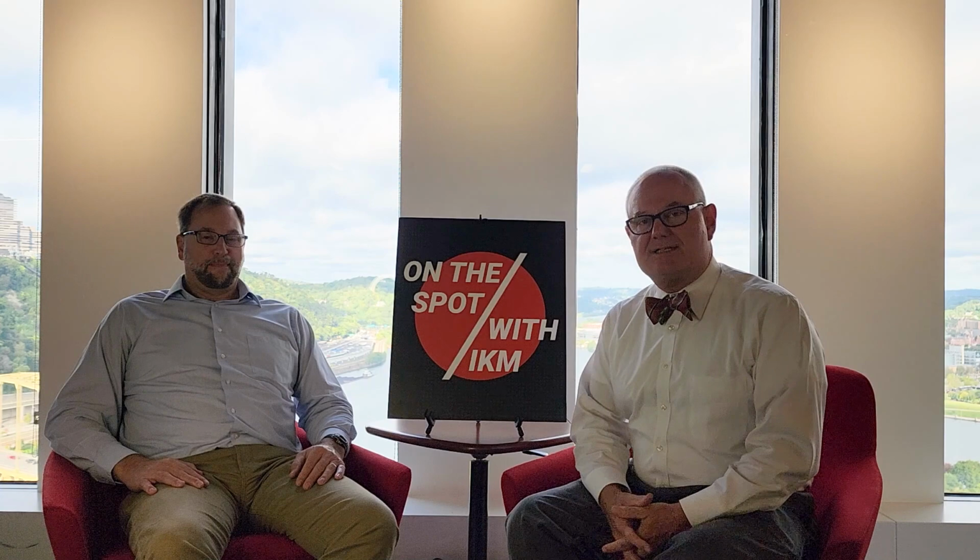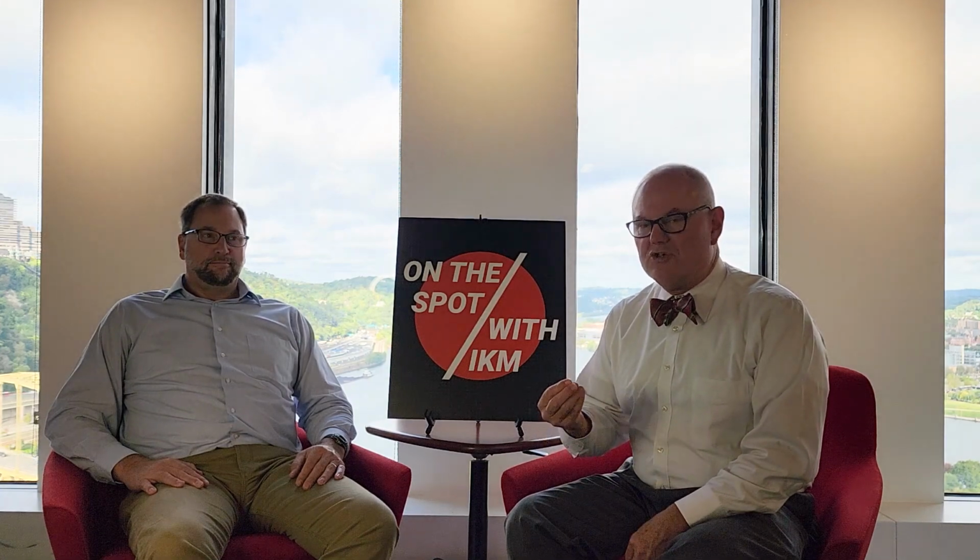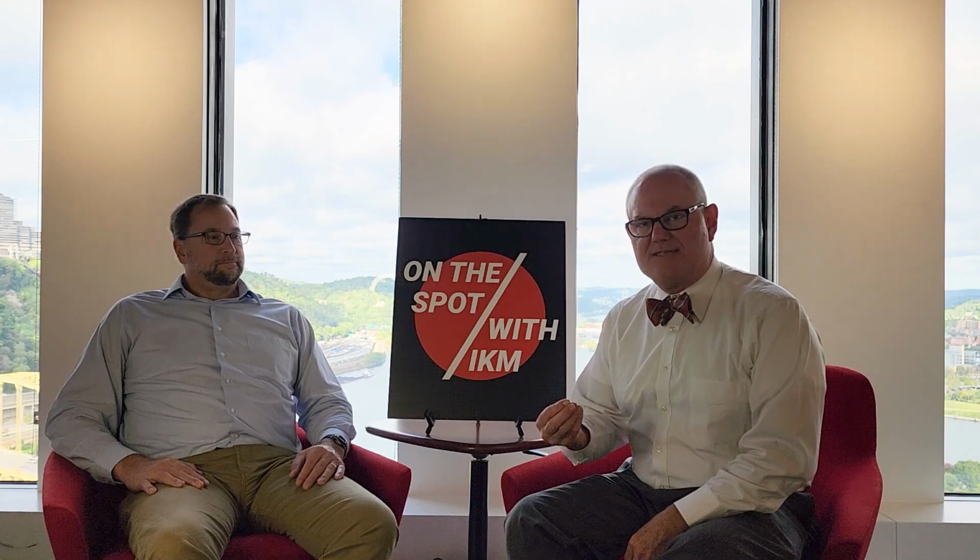Brian leads our science and technology group here, and we want to talk a little bit about the nuances of designing BSL-3 laboratories. Now, Brian, maybe tell people what a BSL-3 really is.